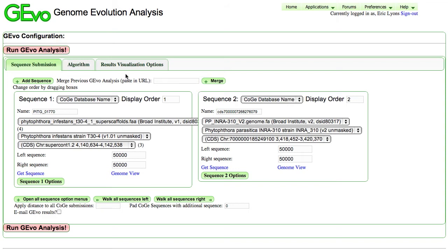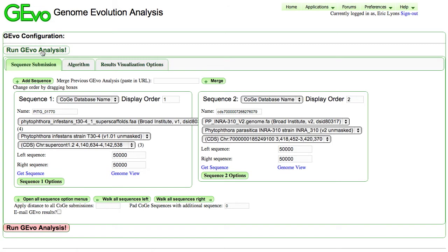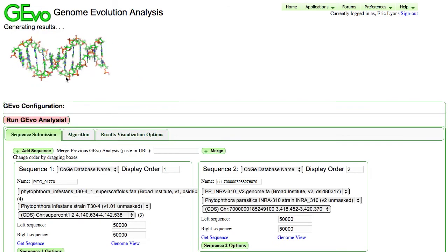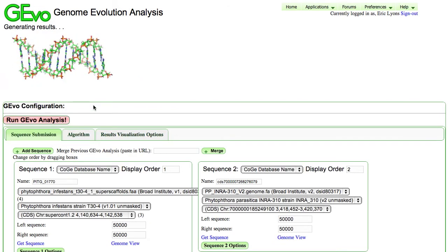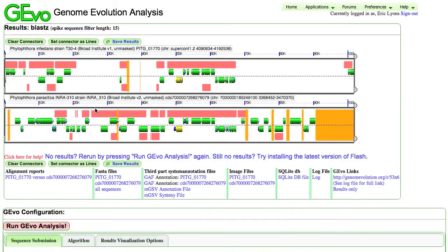And what GEvo does is it allows you to compare regions in high resolution. So in this case, we're anchoring ourselves in these two genomes at this particular pair of genes. And we're going to extract out that gene along with an additional 50 KB of sequence upstream and downstream from it in both of these genomes. And I'm just going to go ahead and run the analysis as this is configured.